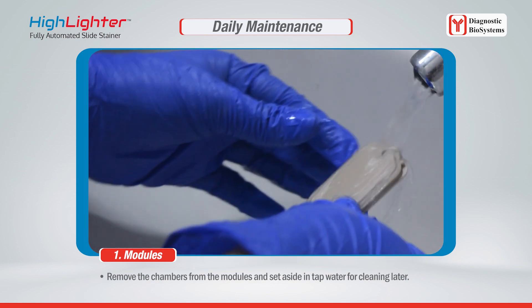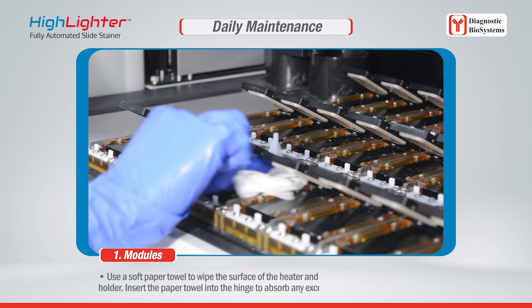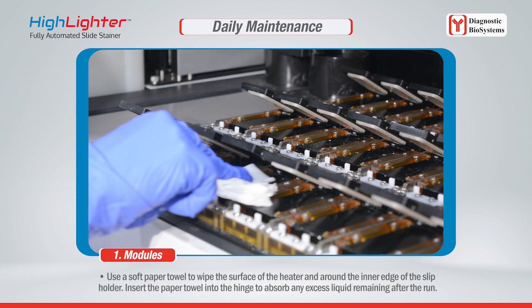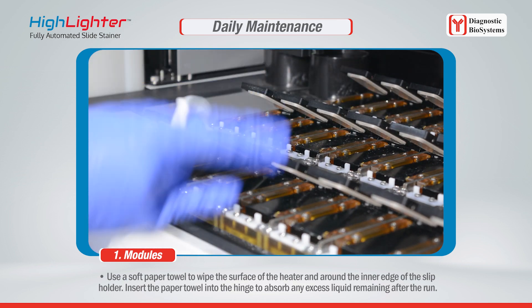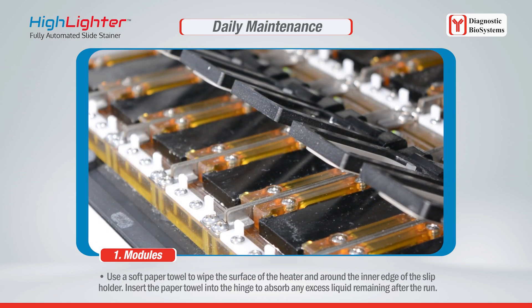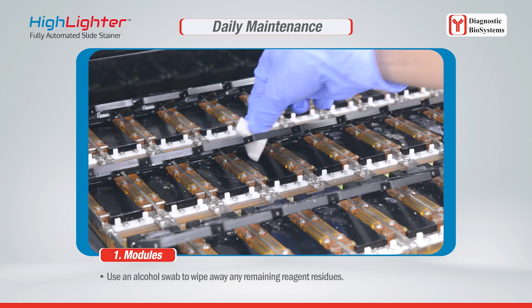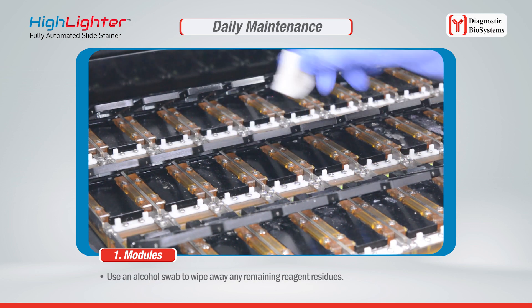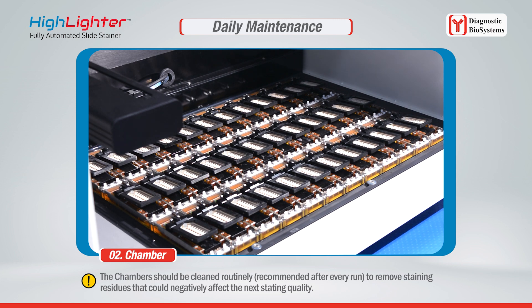Unload all slides from the system. Remove the chambers from the modules and set aside in tap water for cleaning later. Do not use deionized water, as it may damage the chambers. Use a soft paper towel to wipe the surface of the heater and around the inner edge of the slip holder. Insert the paper towel into the hinge to absorb any excess liquid remaining after the run.